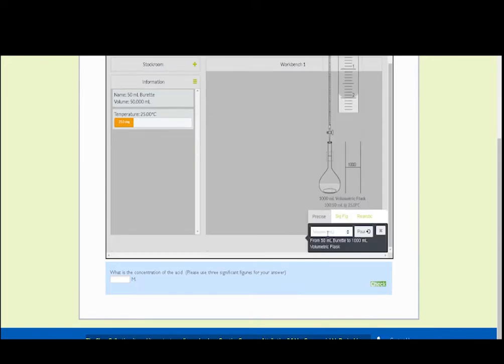So we're going to start with 0.1. Again, make sure to remember your starting value, whether you add as much indicator as I have or not, just remember what it is. And we're just going to start by adding 0.1 and keep going. You can go pretty fast for the first 5, and then after that I would slow down, because around 7 to 12 is when it might start to turn pink. It's obviously going to be different every time, but I would start slowing down around 5, because anywhere after that I've seen values.